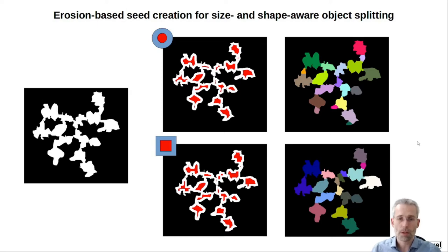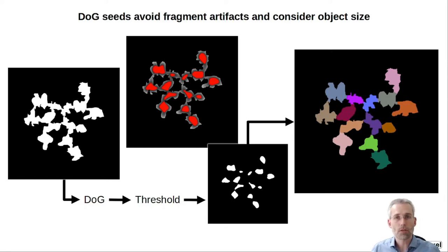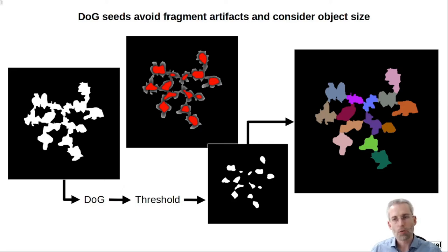Therefore one additional method was added: a Difference of Gaussians (DoG) based separation. A DoG filter is run on the extracted objects, which leads to more homogeneous or smoothly outlined seeds. Those seed regions are then thresholded and extracted, and from them the Voronoi diagram is filled to separate the objects. They do not have as much of a problem with breaking-off parts, but still consider the size of objects, and therefore are quite well suited for these kinds of irregular structures.